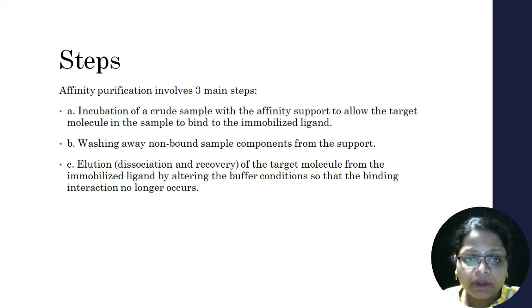Next is the washing step, in which the non-bound components of the sample are washed away from the matrix. Now, once the ligand has bound to the target analyte, the target analyte has to be finally recovered. We call this the elution step, in which there is dissociation and recovery of the target analyte from the immobilized ligand, and this is usually done by changing the buffer conditions or the binding conditions between the target and the ligand.